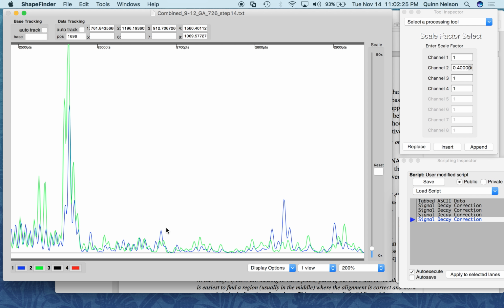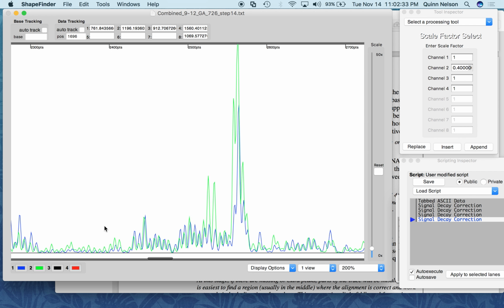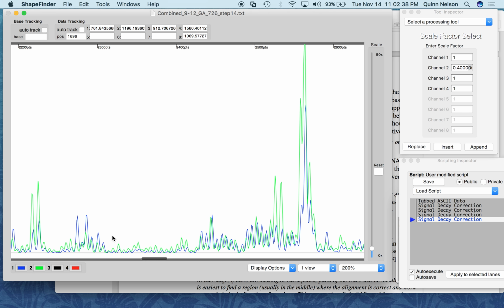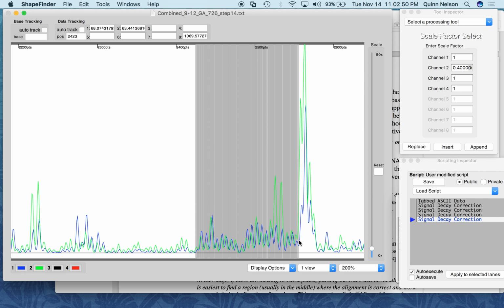And your question is, well, how do you determine what areas of the blue electropherogram have no modification? The answer is the height of their peaks. So right here, I'm going to select this region. This right here is no modification. The blue peaks are very low. Compared to its neighbor to the east, these peaks are probably modifications because they're higher, right?